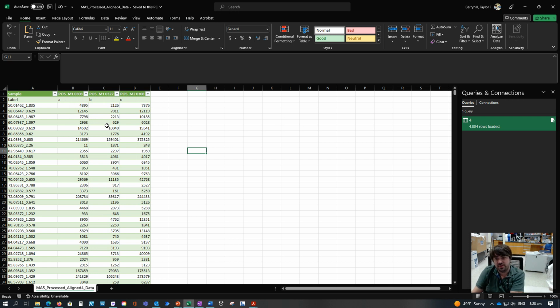And so this is if you have less than 5,000 ion features. If you had greater than 5,000 ion features, we would add some extra steps involving averages of the signal from each of the samples, and I will show you that in a future video.